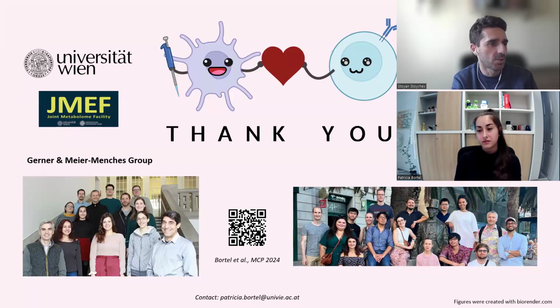We have another question from Ignacio. Hi, Ignacio. I hope you're doing well. Did you test comparing your optimal enrichment conditions versus the beads' recommended conditions in the Astral?